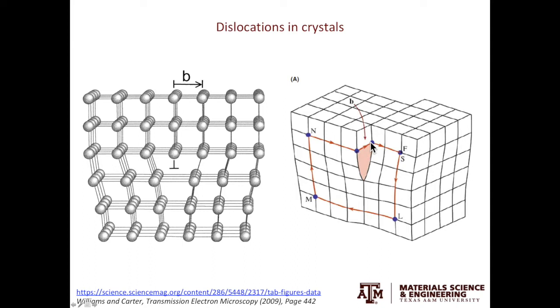If a dislocation line has both edge and screw components, it will be a mixed dislocation. One thing I'd like to draw your attention to is the local lattice bending caused by dislocation cores. In an edge dislocation, it is here, and in a screw dislocation, it is here.